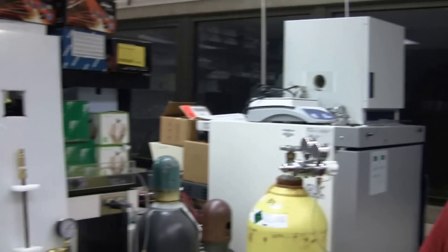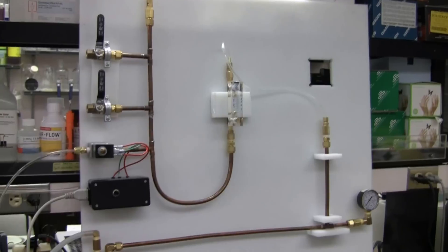Hello, this is Alex, body engineer here. I would like to present our new product, which is a gas delivery manifold.